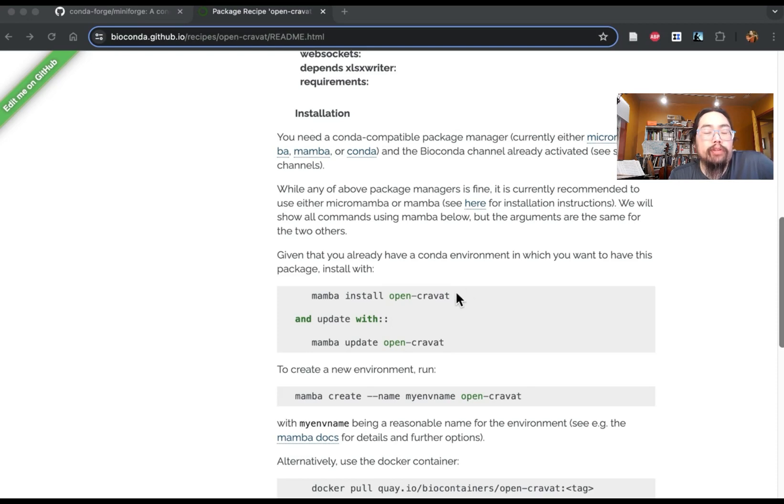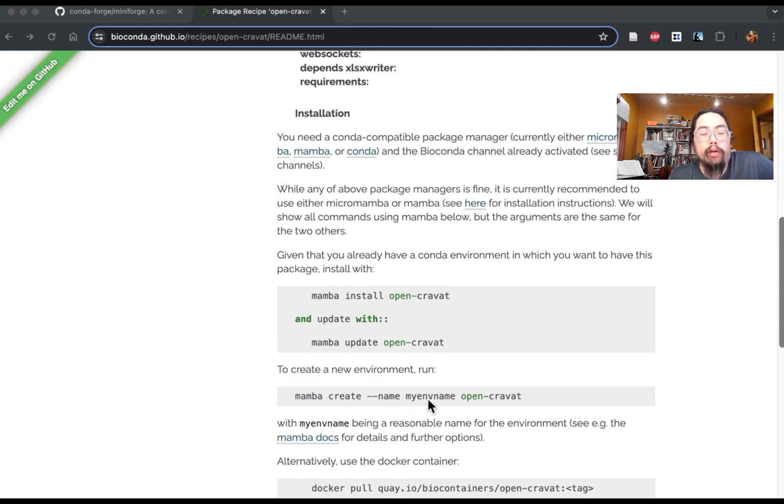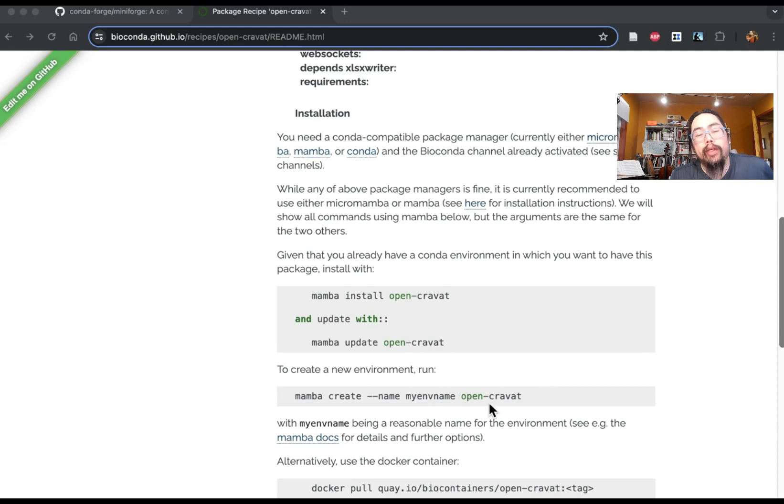So this is the first option, but this is the option that I'm going to take because it's going to create an environment when we install it. So it does everything in a single command.